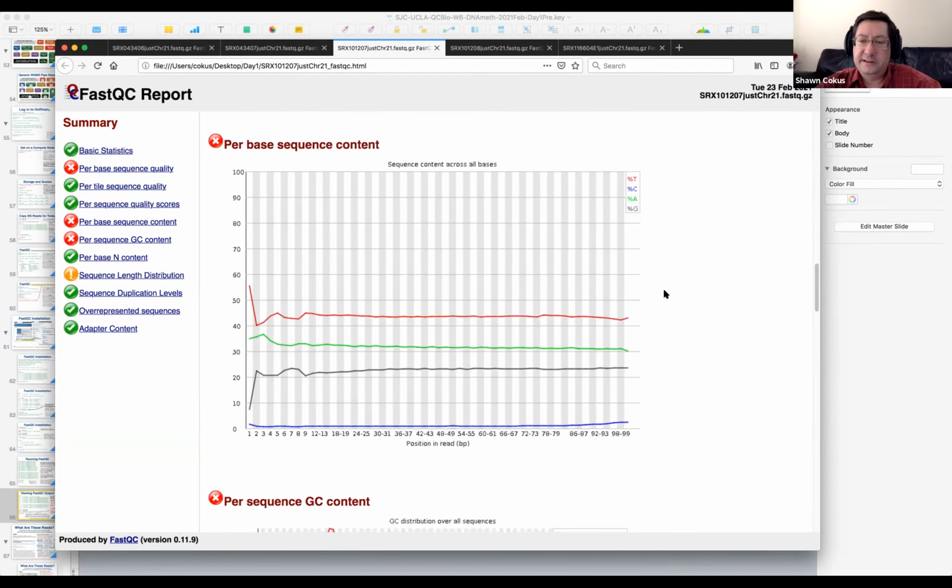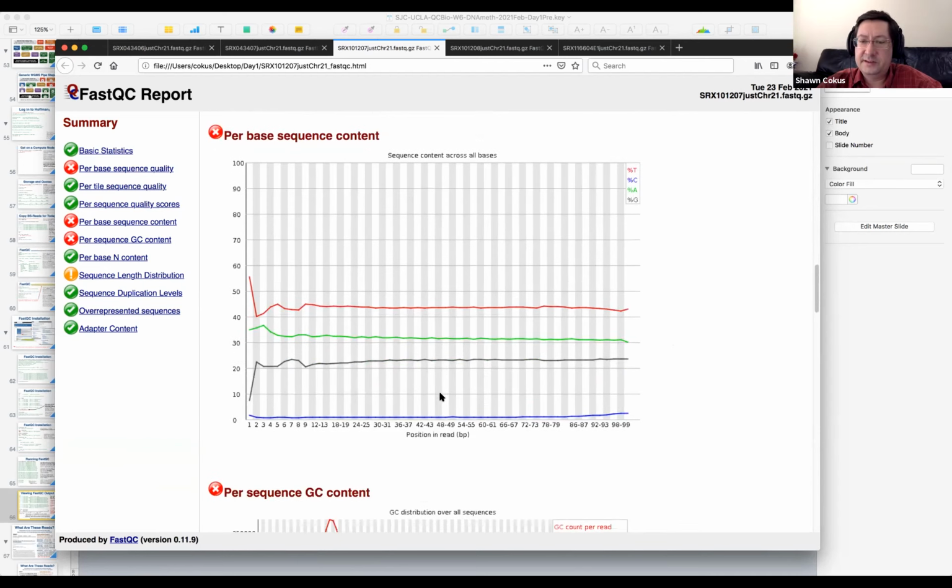And now look at the per cycle ACGT distribution. Well, we've got the pattern where the C is low, the T is higher than the A, but we see some cycle dependence, and that's not good. So here we see there's some sort of anomaly kind of at the front, and we see also that the %C is kicking up at the end. This makes me want to pass to a subset of cycles, right? So maybe we start somewhere on cycle 10, 11, that would get rid of this crap at the front.